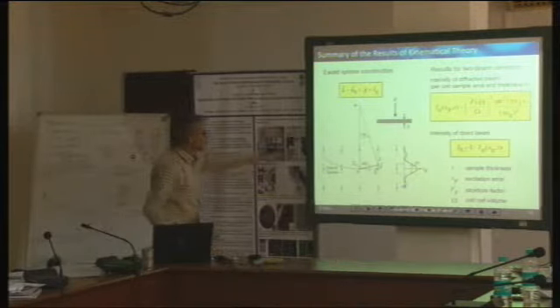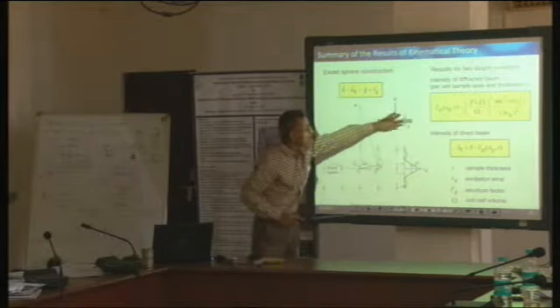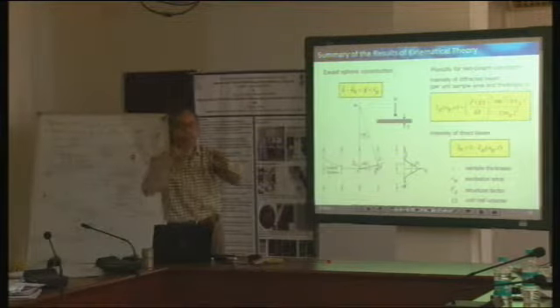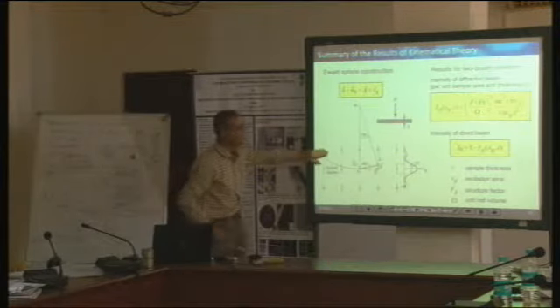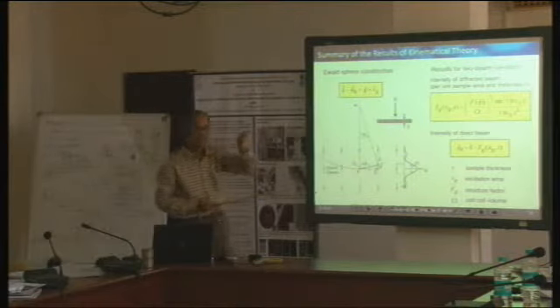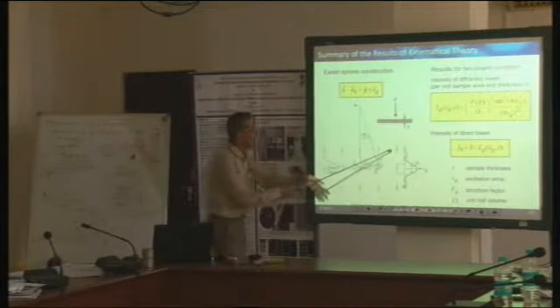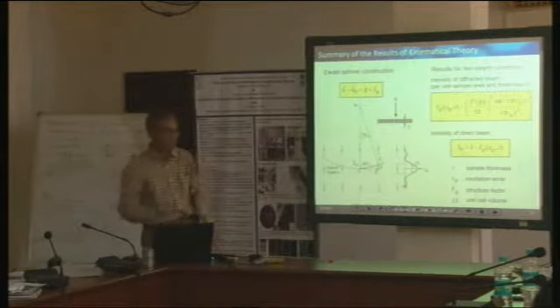Here is an assumption. This is my sample. In this case, we make our sample thin in one direction for the electron beam to pass through. So if I go away from the ideal lattice condition in the z direction, then my reciprocal lattice points are also going to increase in that direction. Correct? In this direction, if I decrease in the real lattice, then in the same direction in the reciprocal lattice I have to increase. That's why, instead of points, I get rods. This was also probably conveyed in some way.